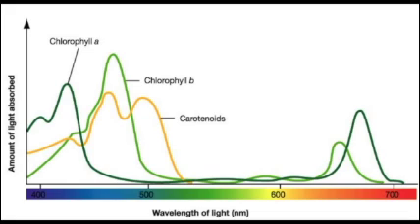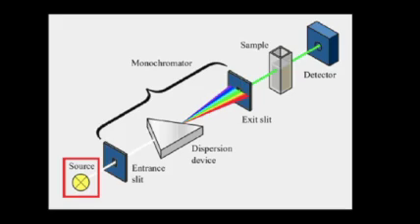Once you have determined what wavelength of light your solution is sensitive to, you will set the spectrophotometer to only measure the absorbance of a specific wavelength of light. You want your sample to be sensitive to that light, otherwise it will be more difficult to differentiate between different concentrations later on because your molar absorption coefficient will have fewer significant figures and therefore affect your precision.